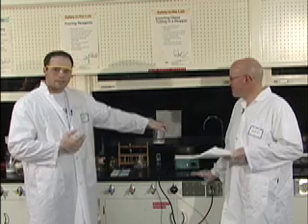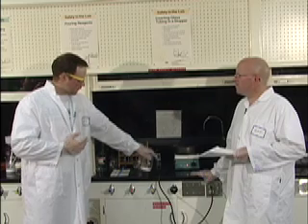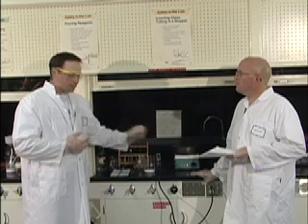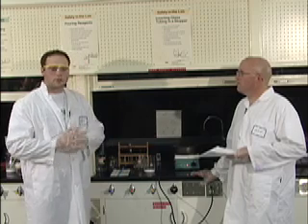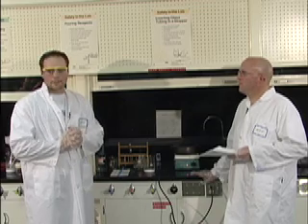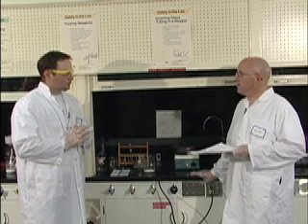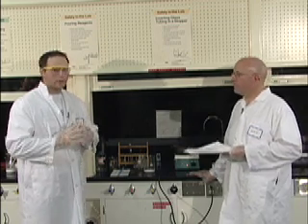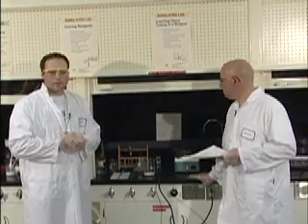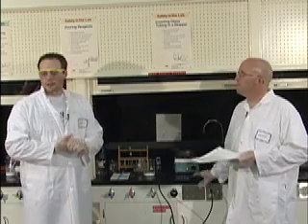So with salicylic acid, be very careful when you're measuring out your 27.5 grams. In this case, we've already pre-measured 27.5 grams into a 600 milliliter beaker, and it's ready to go. Just be careful when you're scooping it out that you don't breathe in the dust and you don't eat any of the salicylic acid. They can weigh this out over on the side. Definitely, that's where they can weigh it out. Just don't breathe it in. You weigh it on the analytical balances on the side of the room, making sure that you use a weigh boat, of course, to weigh your salicylic acid.